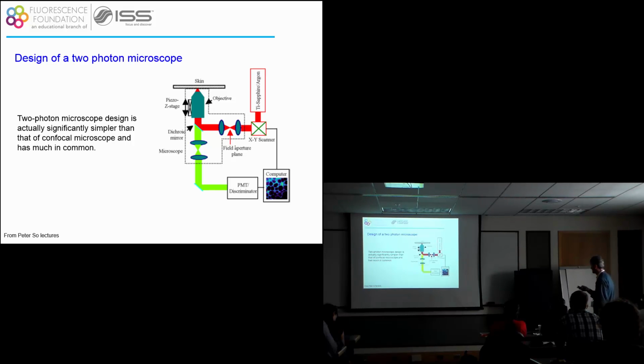This opens a lot of possibility, especially in tissue spectroscopy, but also in biology to study cells. Because you use 800 nanometers, you go more into the cell, but especially in tissue because you can go deeper into the tissue.